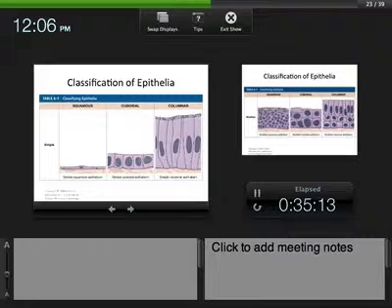These are some classifications of epithelia. I talk about this in lecture too, so I might go over this quickly, but you'll need to know this for these slides. There are simple layers of epithelial cells, meaning just a single layer. Squamous means squashed, flat.